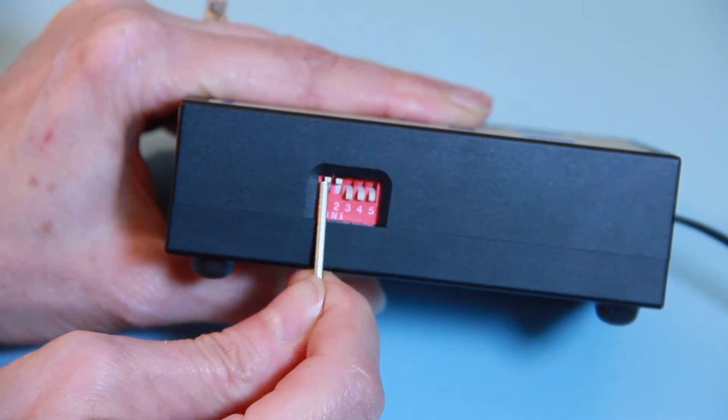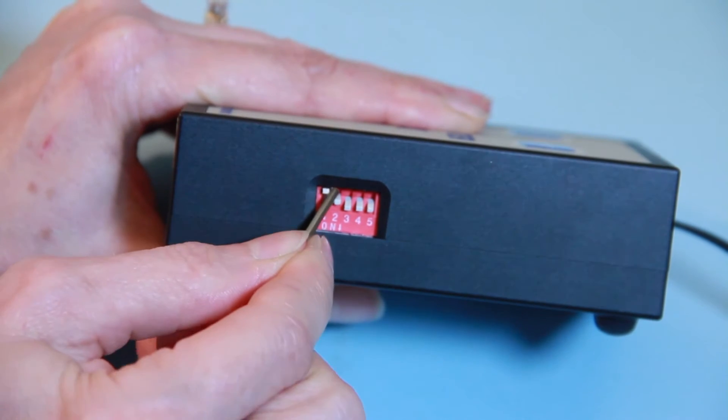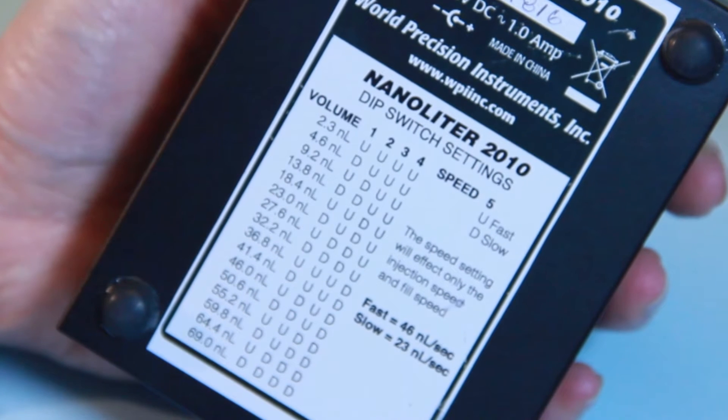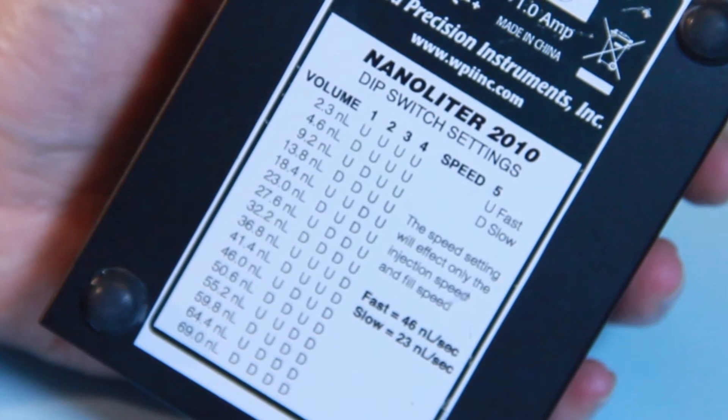By setting the DIP switch, injection volume can be changed from 2.3 to 69 nanoliters in 16 steps.